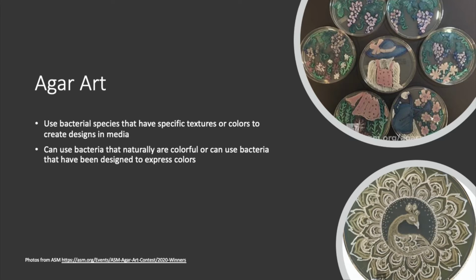If you want to see lots of examples of agar art, you can go to the ASM website and look for the agar art there. I think they have a competition every year for the best agar art that their microbiologists can create.